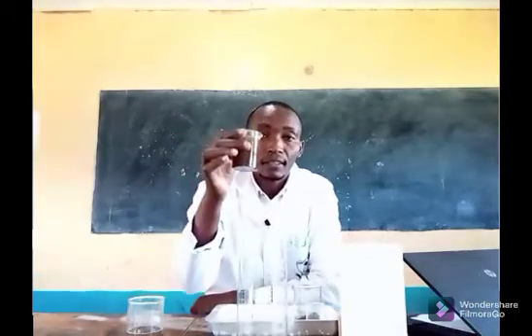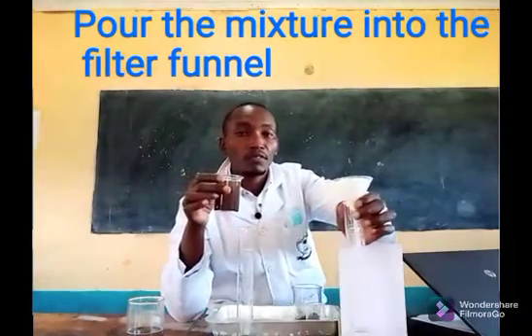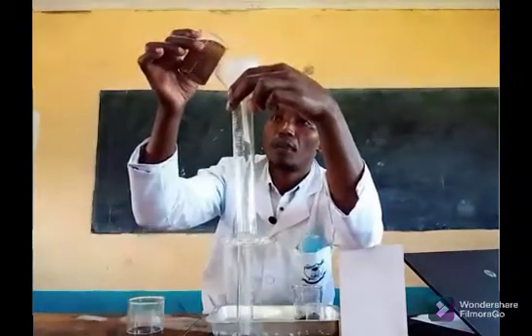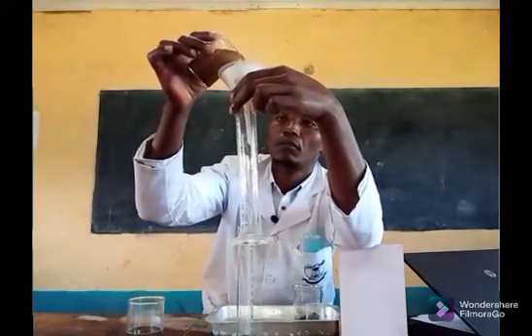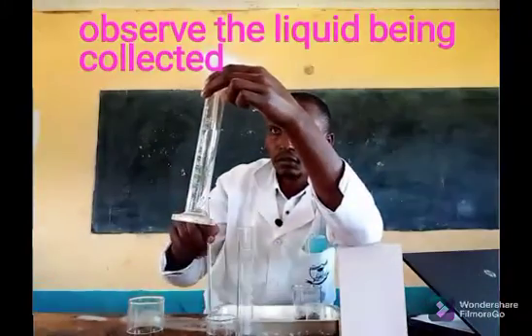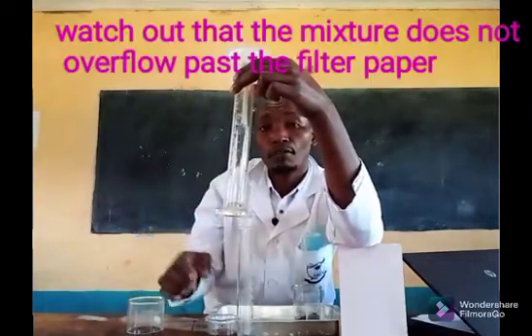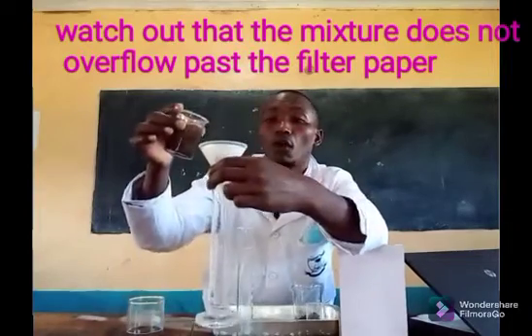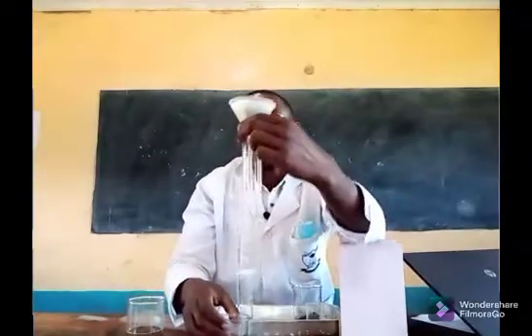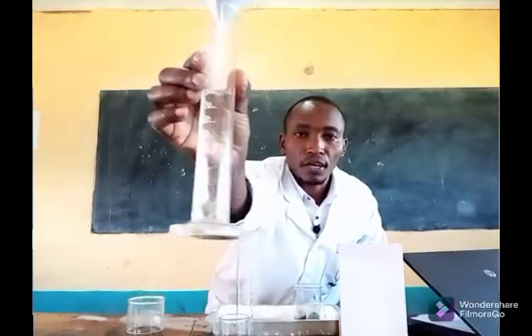So what I do, I take my mixture now, then I do filtration. With that, we are going to observe what exactly will happen. So I'm doing filtration. What you need to do with the filter paper, ensure no overflow. Make sure all the liquid that you're filtering is inside the filter paper. So basically, that's what is happening.